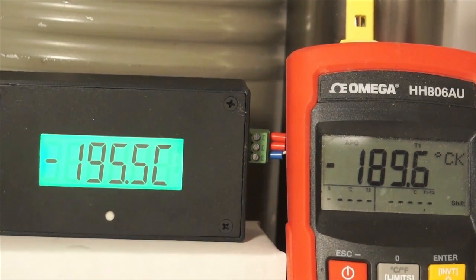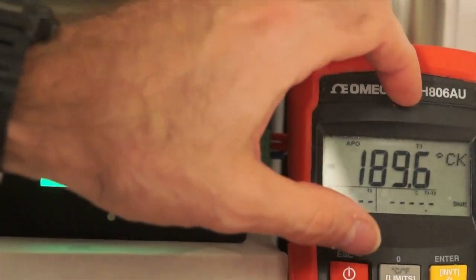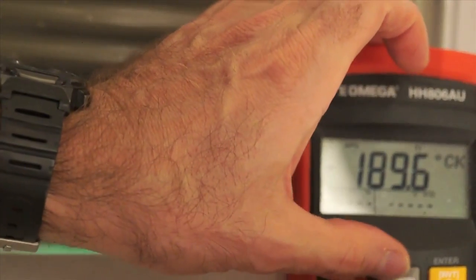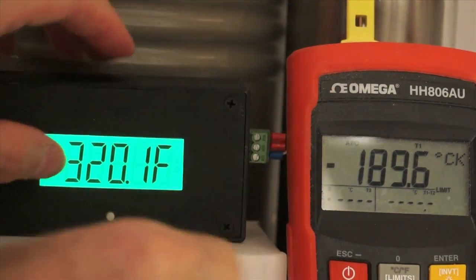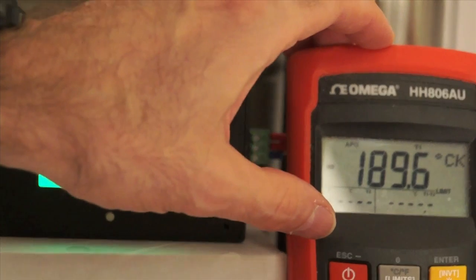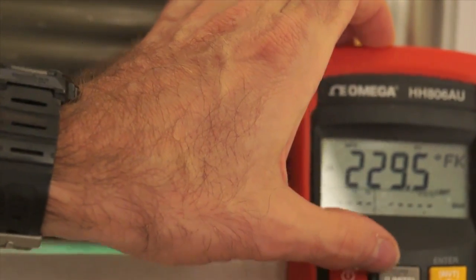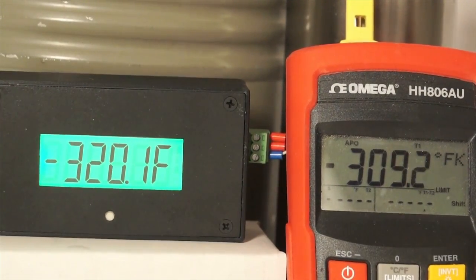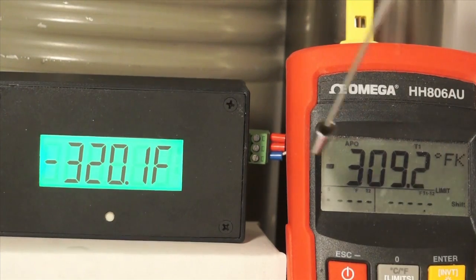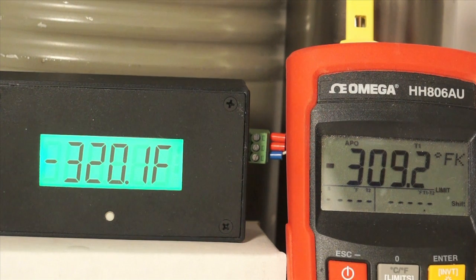Now I personally like Fahrenheit, so I'm going to switch these to Fahrenheit in case you're more comfortable with that. There we go. So minus 309 on the Omega, minus 320 on the Crybaby.